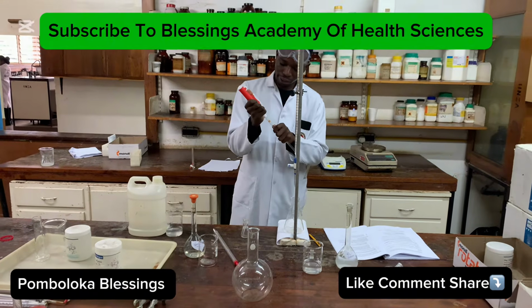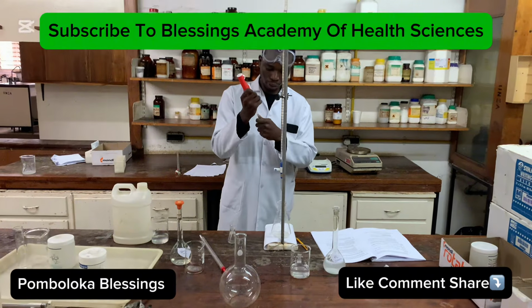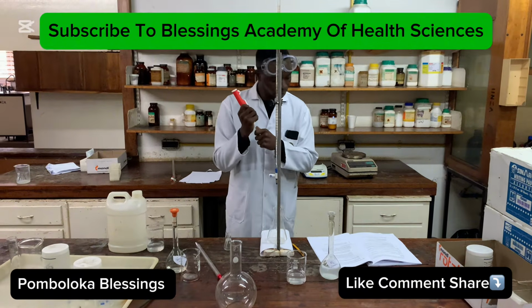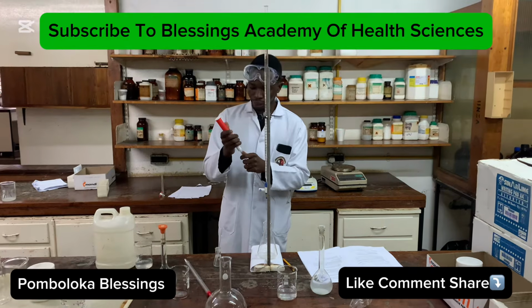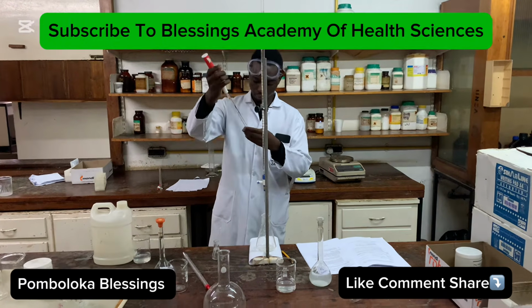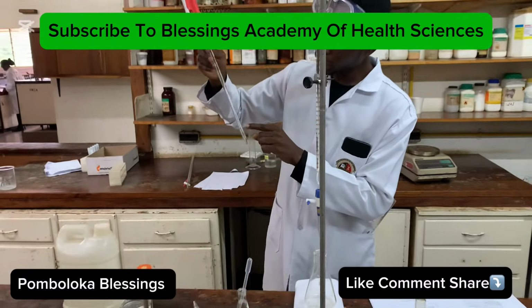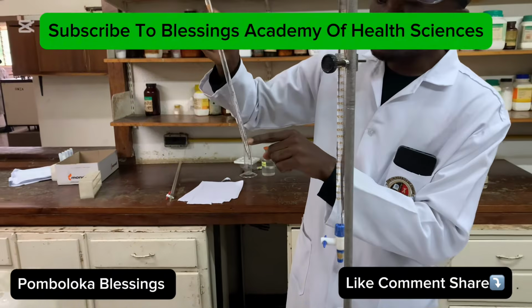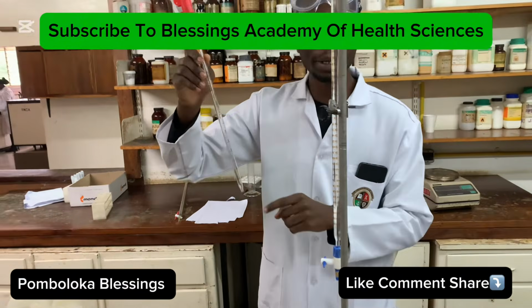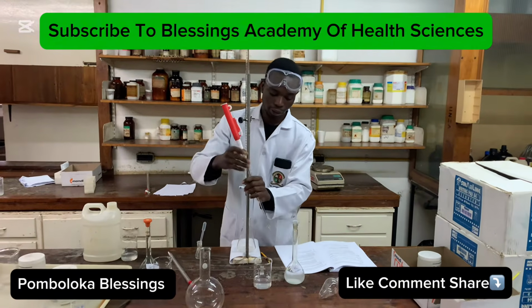So we are pipetting 5 cubic centimeters of the ammonia, and then we're going to get 25 milliliters of the hydrochloric acid, whose concentration has been given as 0.1. So if you check your pipette, we have 1 there, 2 there, 3 there, 4 there, 5. So we're pipetting 5 cubic centimeters of the ammonia.